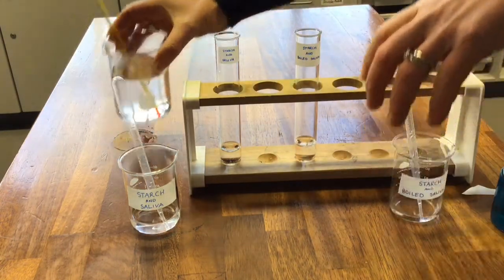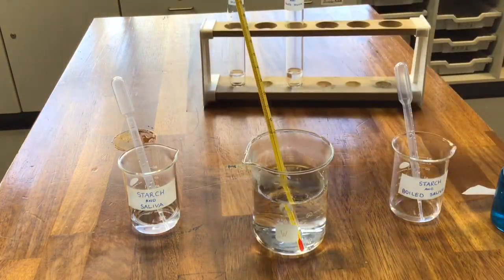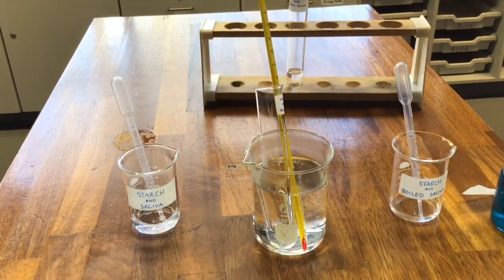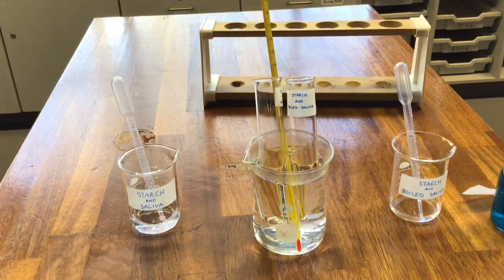These are then placed in a water bath. So this is our water bath, and our water bath is set at 40 degrees, and 40 degrees is the same as body temperature. So this will be left for 10 minutes, and then we will test the contents of the boiling tubes to see what they contain.